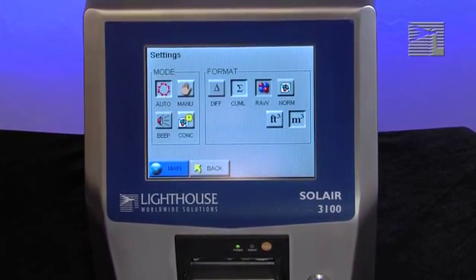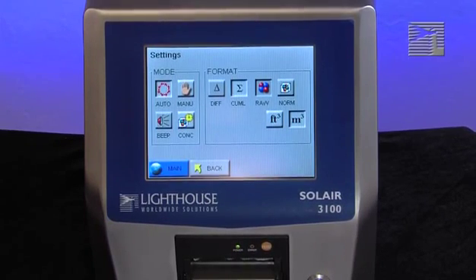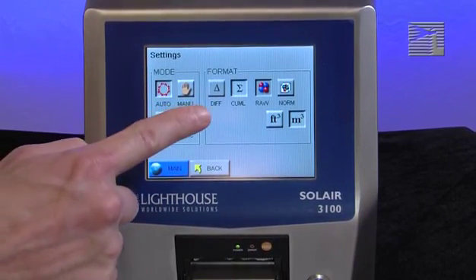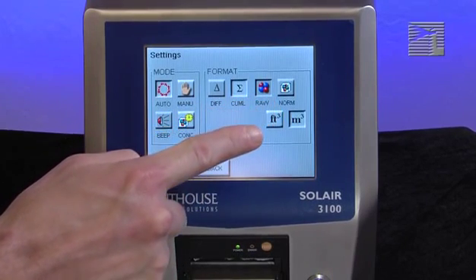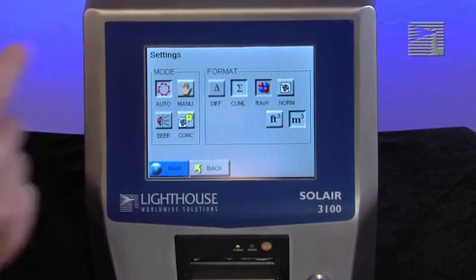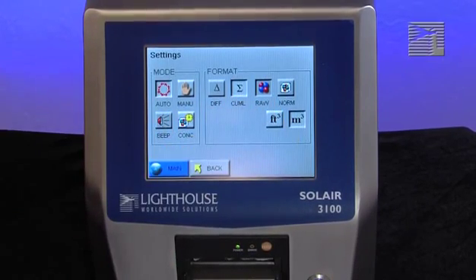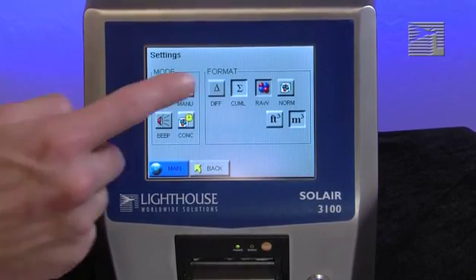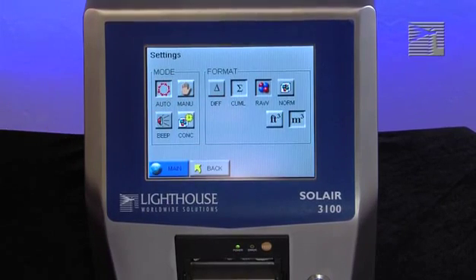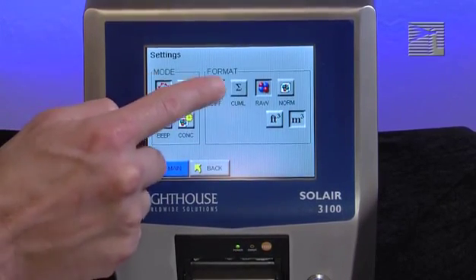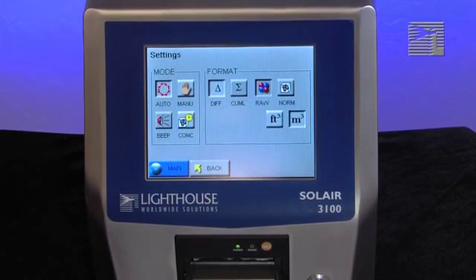In the format section of buttons, you will find six different buttons. They are Differential, Cumulative, Raw, Normalized, Cubic Feet, and Cubic Meters. Data on the instrument can be displayed in Differential mode or Cumulative Counts. Select how you want the data to be displayed on the main screen and move to the next set of buttons.